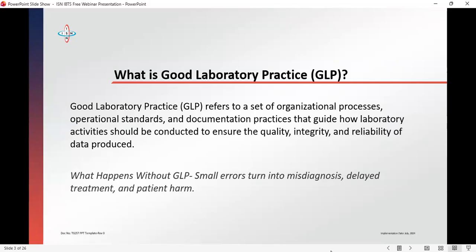They will think, oh, good laboratory practice is just about standard operating procedures, right? Good laboratory practice is just about documentation. Make sure you're documenting properly. Good laboratory practice is all about your quality control charts, and sometimes even inspection and audit. That's the thing that comes to the mind of everyone when you hear about good laboratory practice. But I want to let you know today that good laboratory practice is much deeper than that.